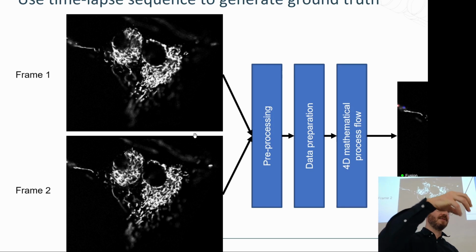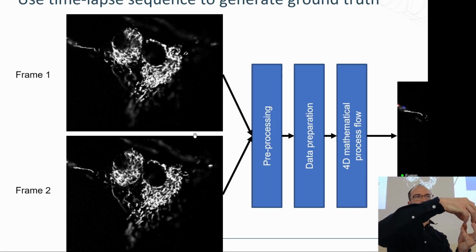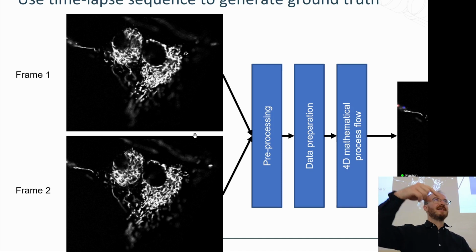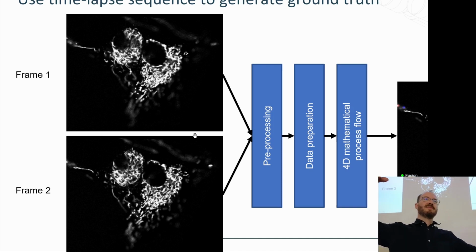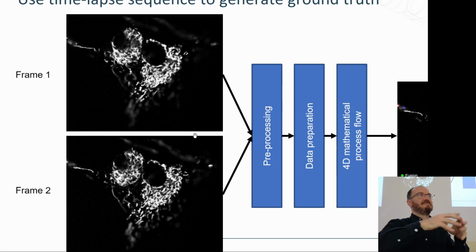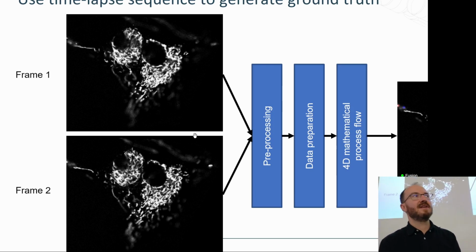It's just that they were two separate structures and now they are joined. You'll see some examples just now. So the size would be bigger? So let's say I've got two filaments, two little worms. Then they can come closer and then boom, now they're one worm. That's fusion. So the size, you could look at size, that is definitely one component to look at.